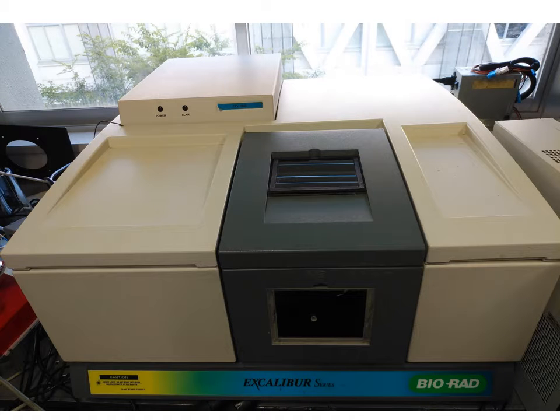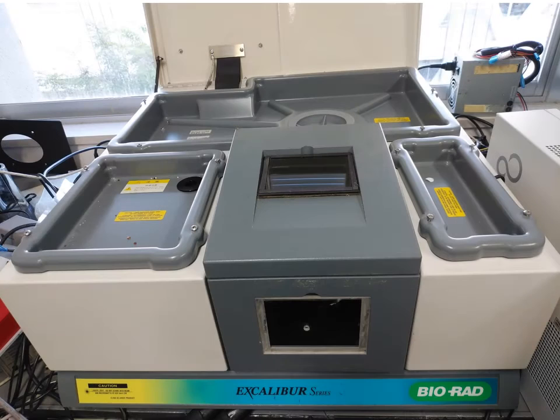Next, let's take a look inside the actual FTIR. This is an FTIR called Excalibur, manufactured by Biorad. About 20 years after purchase, it has already retired from the front line, but it can still be used for measurement. This part is the measurement room.